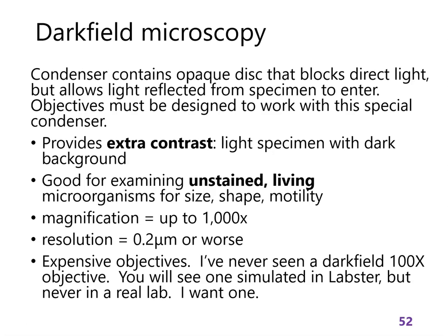You can get a 100x dark field objective, but it's really expensive. I've never actually seen one in a laboratory. I really wish that what I would get for Christmas would be a dark field 100x objective. But they cost as much as a whole microscope. I think they'd be $2,000 just for that one lens.